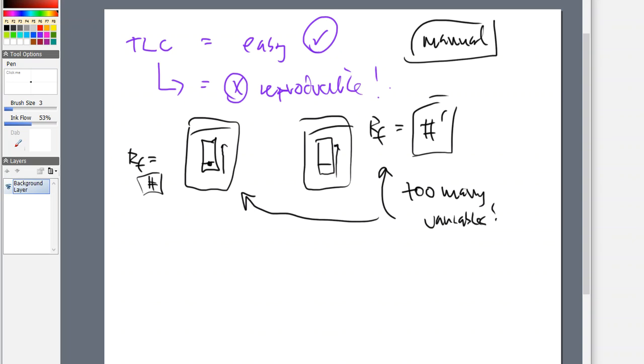Over the course of time, we kind of hit home with TLC, and we wanted it to be better. We wanted it to get the attention that it deserved, and hence HPTLC comes into play. This is the instrumentation that we will be using in the laboratory setting that streamlines this much better, that gives us more reproducible results, things image better, things separate better, and it's all due to the HPTLC instrumentation. Again, the HP stands for high performance thin layer chromatography.